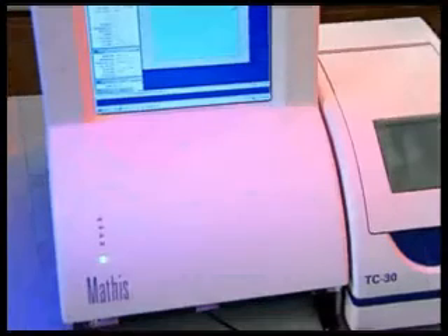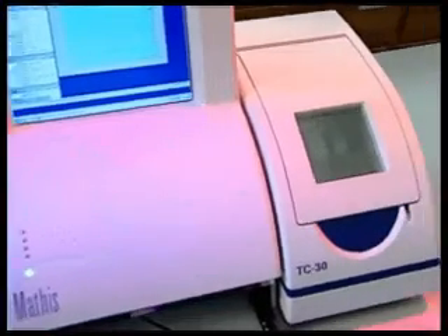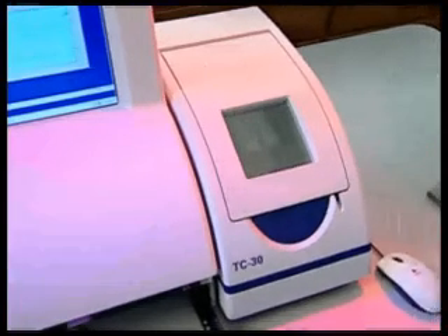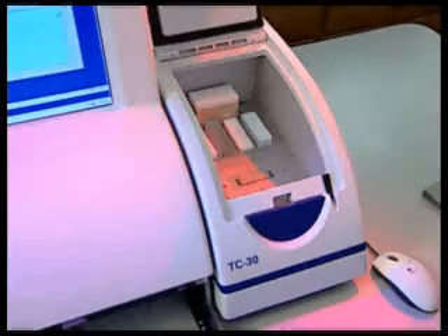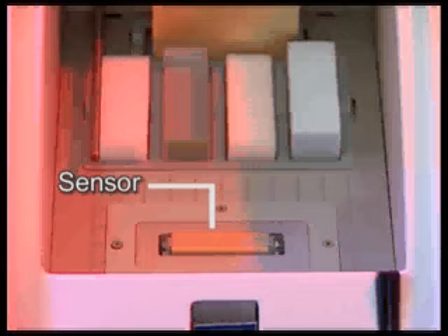The other key component is Mathis' patented sensor. The TC30 sensor can be external or located within this temperature-controlled isothermal chamber. The isothermal chamber houses the highly accurate sensor, which is spring-loaded to ensure optimal sample contact.